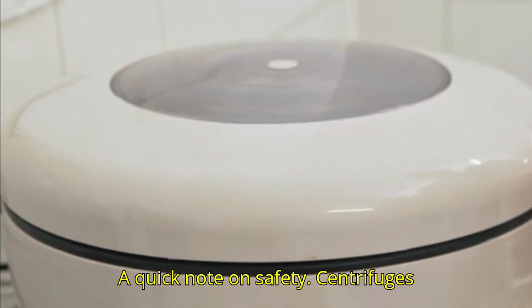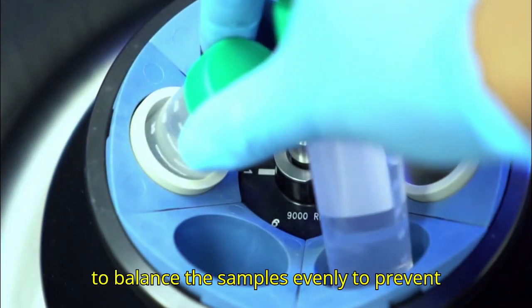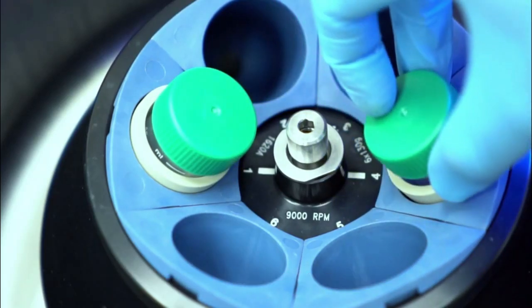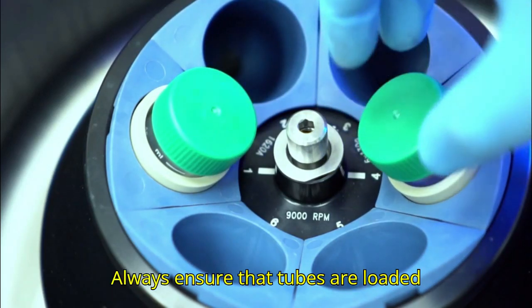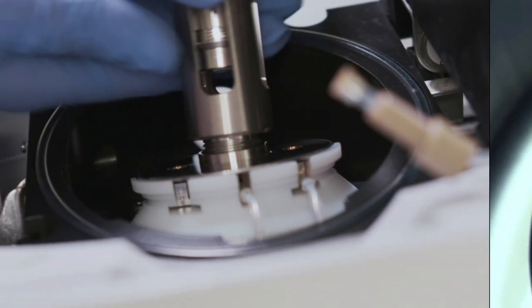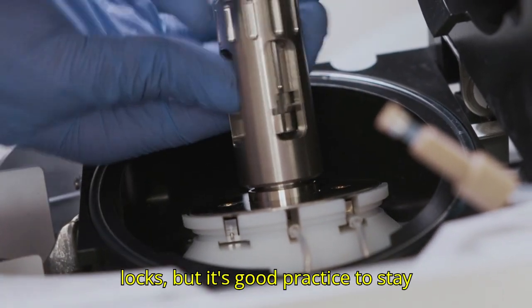Finally, a quick note on safety. Centrifuges operate at high speeds, so it's essential to balance the samples evenly to prevent vibration and potential accidents. Always ensure that tubes are loaded symmetrically and never open the lid until the rotor has completely stopped. Modern centrifuges come with safety locks, but it's good practice to stay cautious.